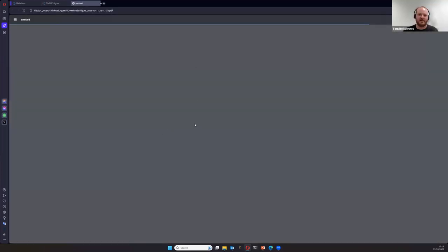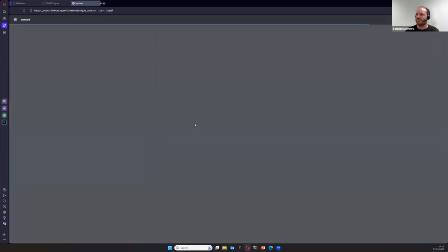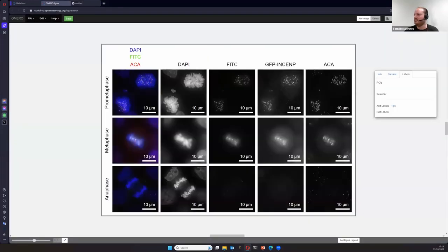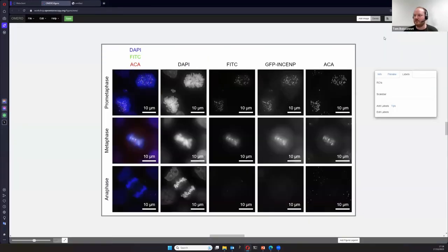I can adjust my canvas size to my figure by going to File → Paper Setup → Crop Page Around Panels, which automatically fits the canvas to my images. Then I can export to PDF. The PDF file is ready for download, and you can open it with a PDF editor to edit labels further, add text, change colors, or change fonts.